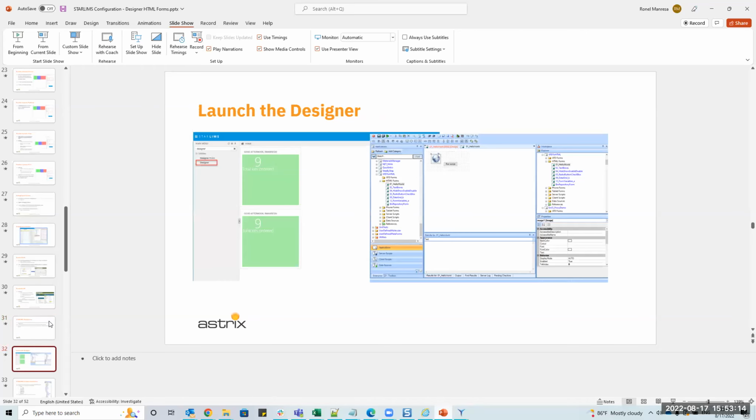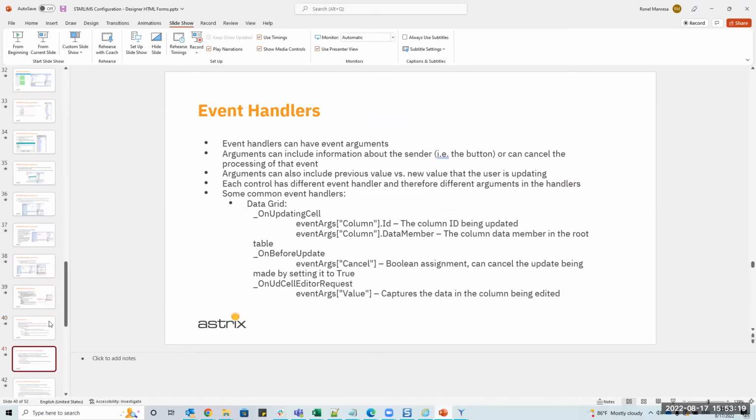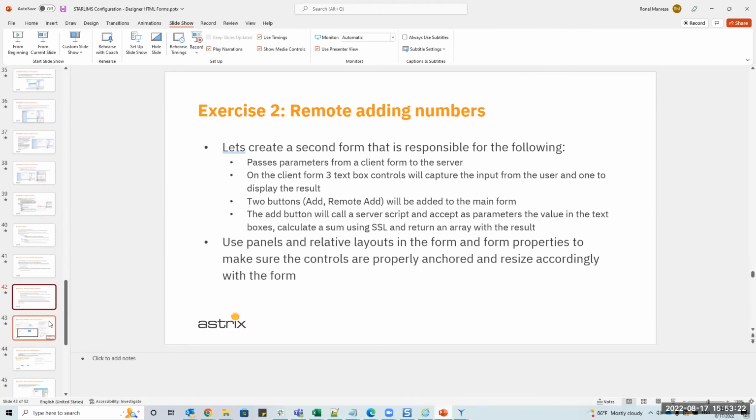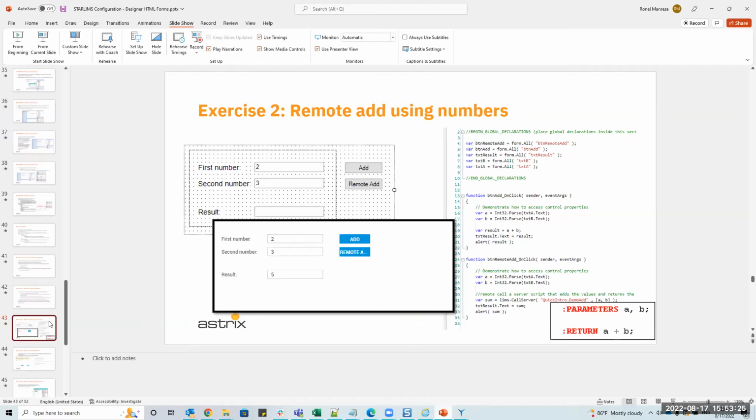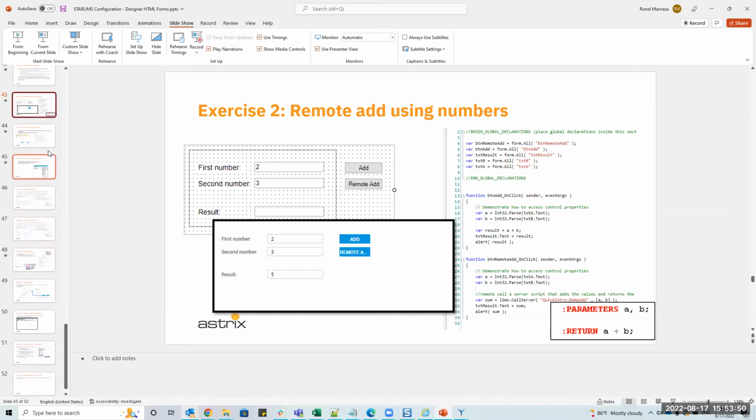Okay, so now we're going to go into exercises with 7 minutes left. But let's at least, all of us should do a hello world. Or maybe all of us should do this program. Who can stay a few minutes over? Are you guys okay to give me another half an hour? Jordan, Jajid, are you good? Yeah, that's fine. And the people in Costa Rica? Yeah. Because I included training and we spent that time.